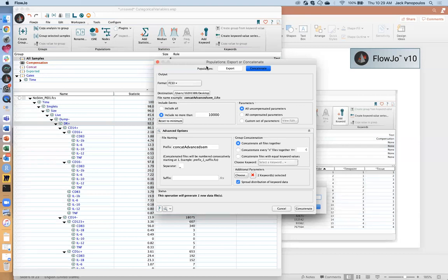Now in terms of deriving medians and things of that nature, statistics, the effect that you see in FlowJo, those statistics that are derived, it is a visual change. You're not actually changing the values of the data, so for the median or the geomean or whatever statistics you're trying to derive, none of that changes.